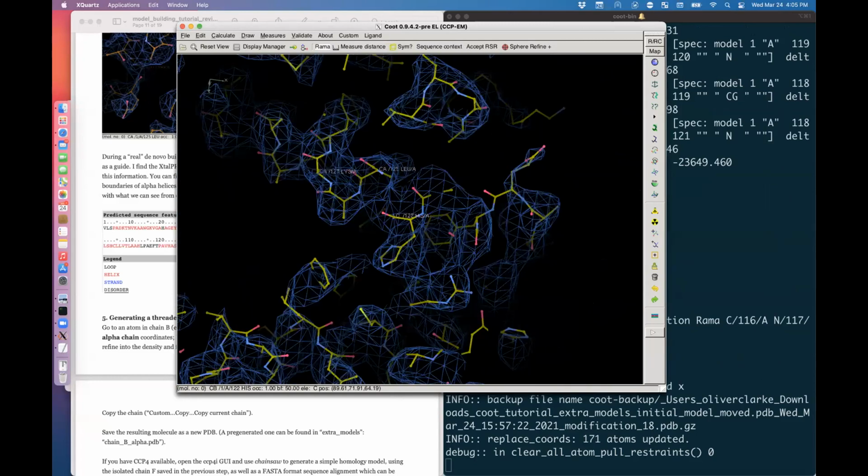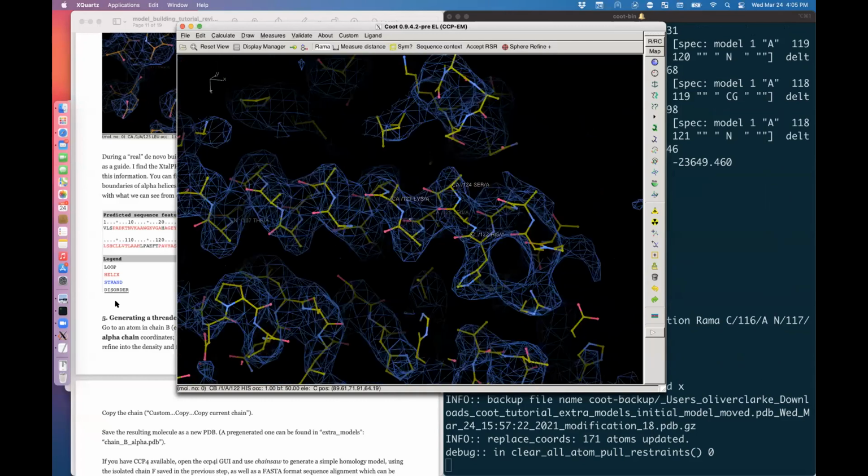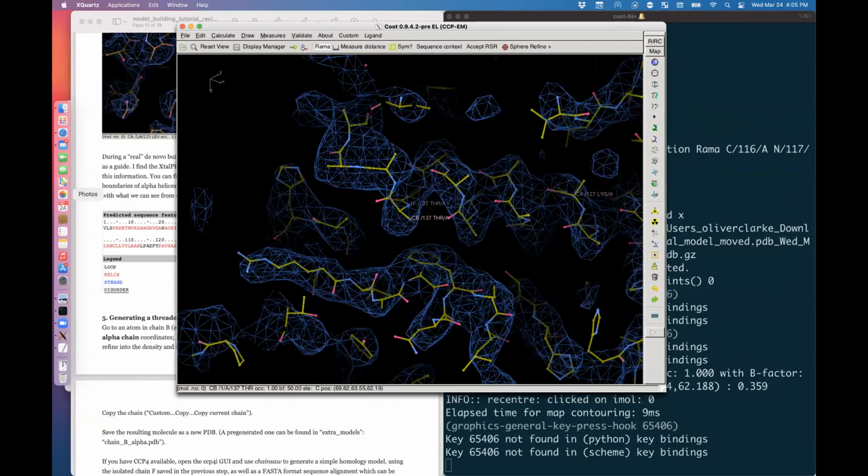All right, is this making sense to everybody? Is everybody still on track? Are people getting extremely bored? It's very hard to tell what's going on over Zoom because I can't see anybody, but hopefully this is making some degree of sense.